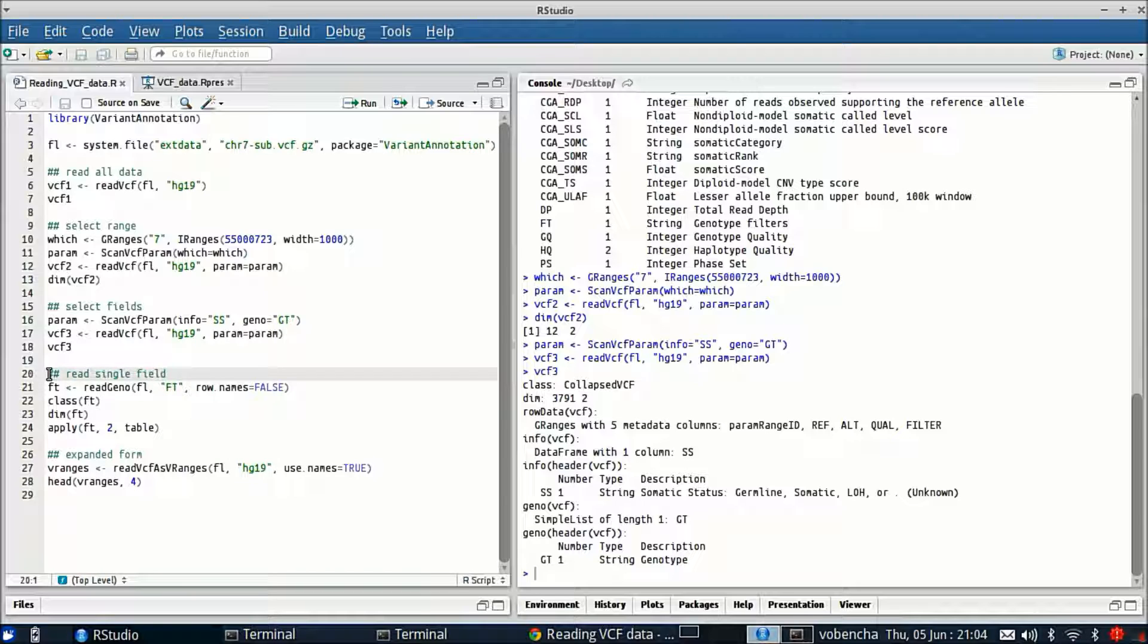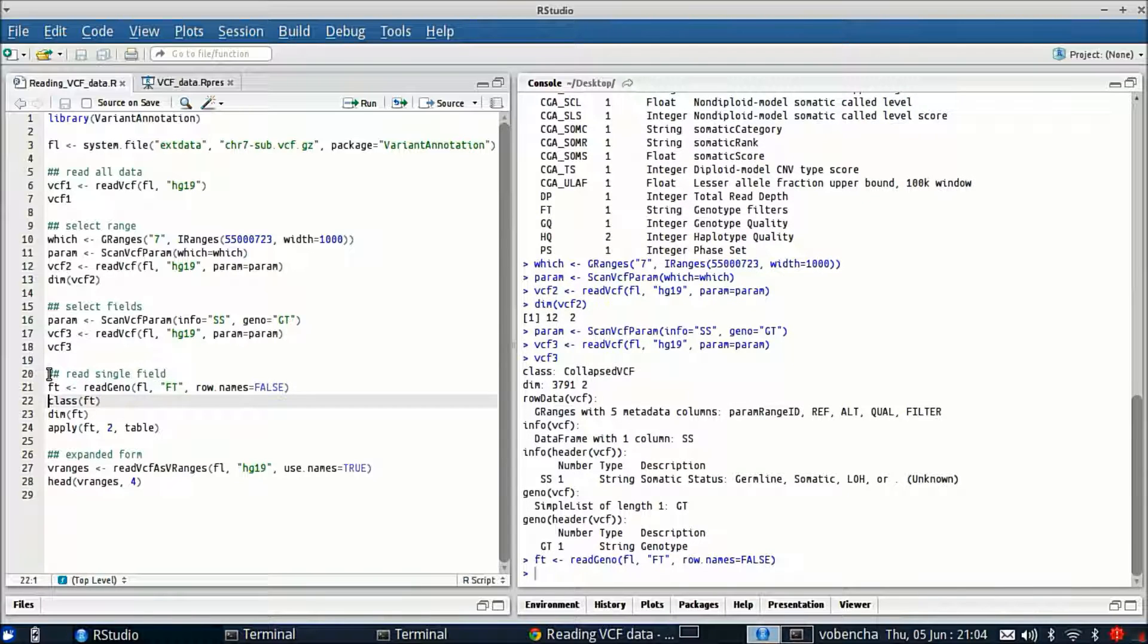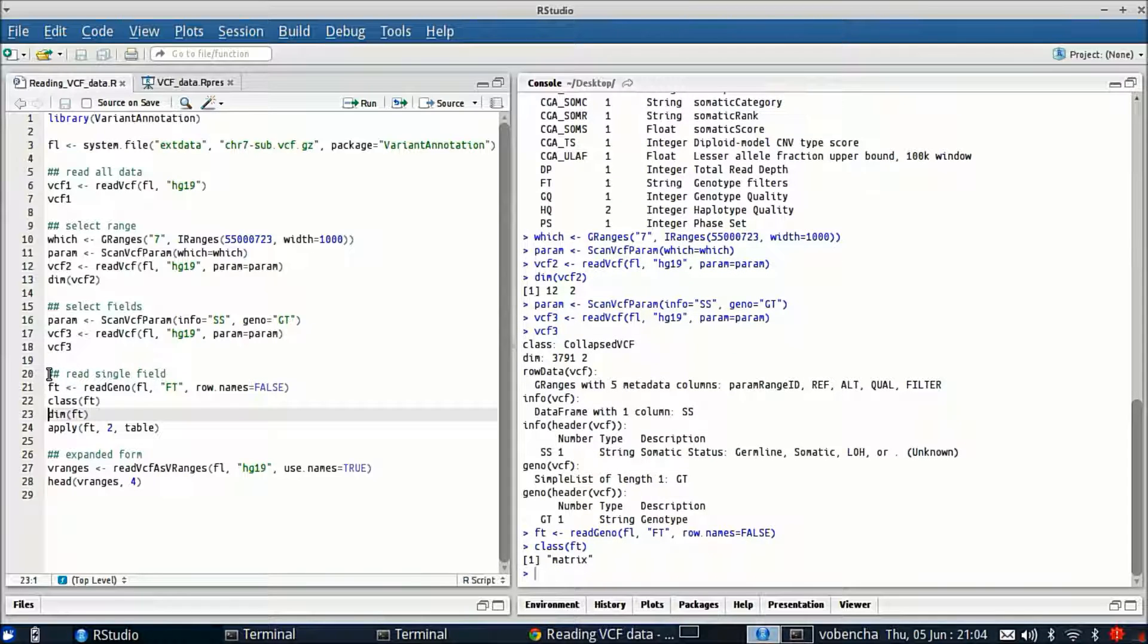All right so next, this is one of the lightweight read functions. This is readGeno where you just specify a single geno field. We're going to specify FT which is actually a filter.